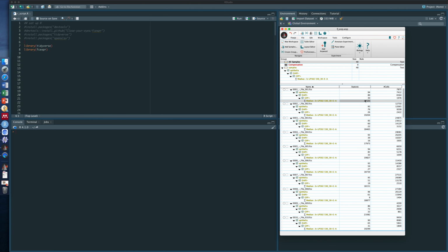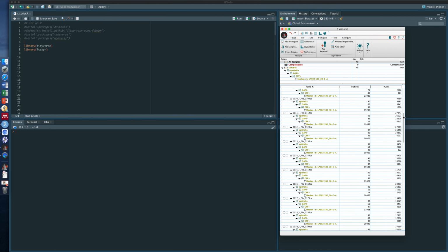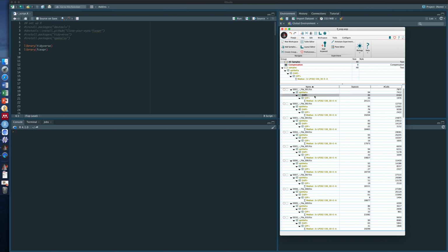The focus of this video really is to demonstrate the technical aspects and not so much the biology. Still, of course, I want to tell you what kind of data we are looking at here. These data come from a retroviral transduction where a GFP gene was transduced into epithelial cells. And the question is, among these 48 files that we have here in our workspace, which of these variations is best to induce a high frequency of GFP positive events in the end. So that means which condition is best to make the transduction efficient.